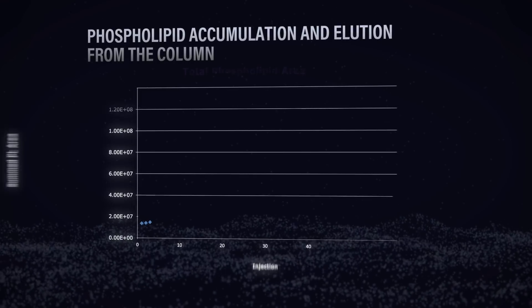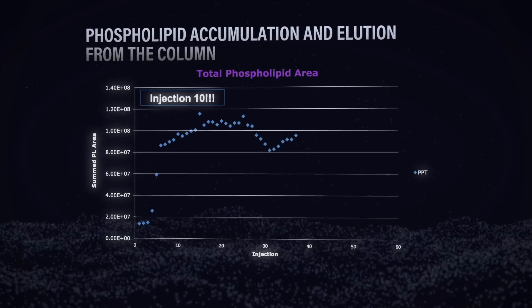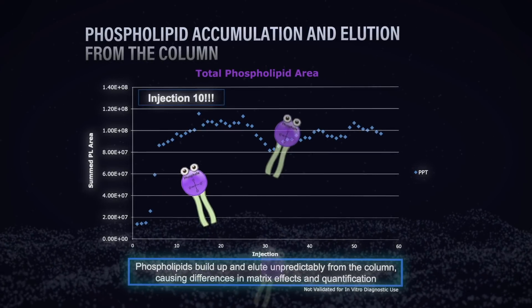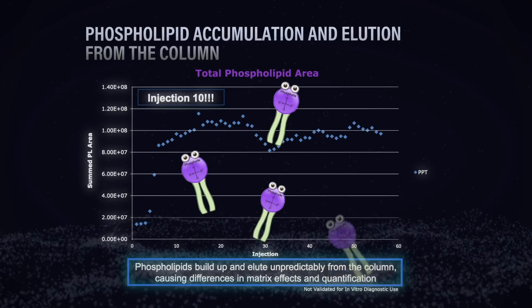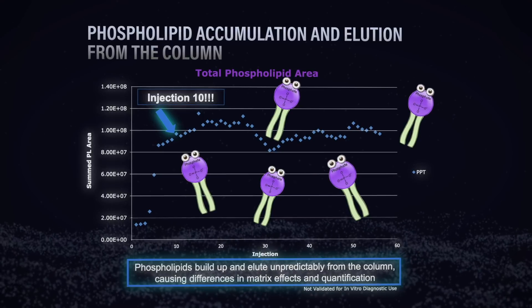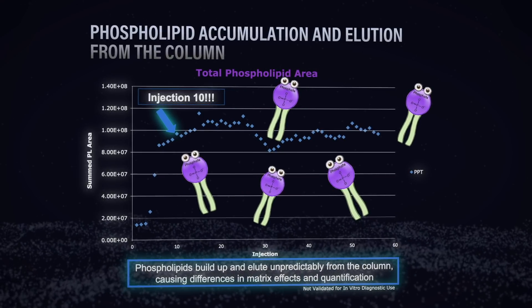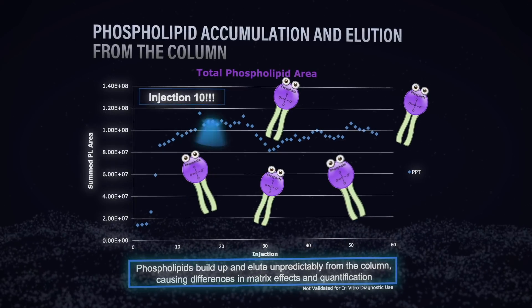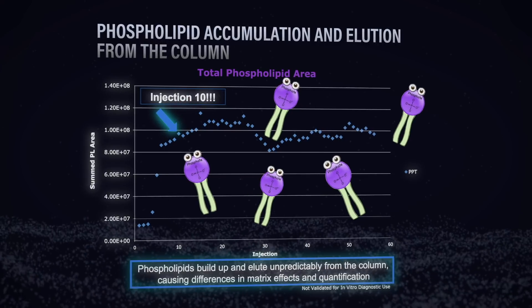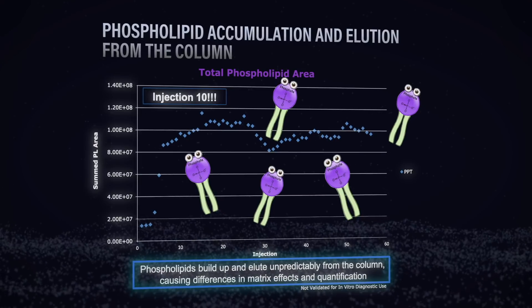Here we've done multiple injections, one after the other, monitoring how these phospholipids build up on the column. You can see really early on, up to maybe injection five or six, the phospholipid count coming off the column isn't that much. But over time, you can really see how they're coating the column, coming off the column, and not coming off at the same rate — giving you a lot of irreproducibility.